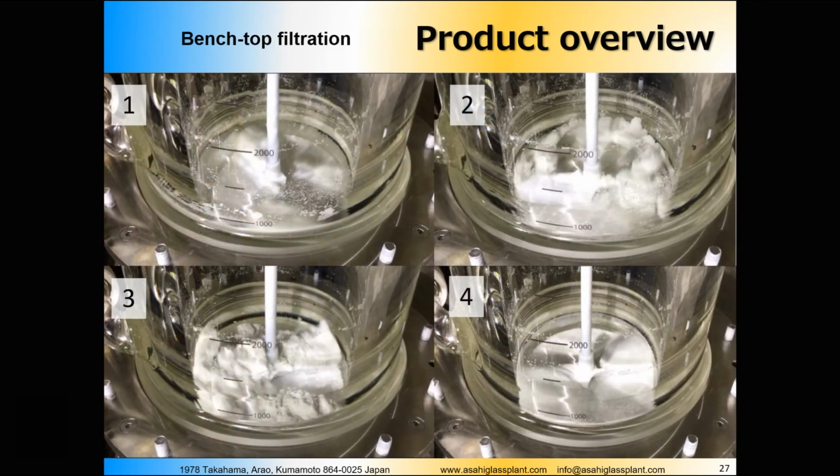So here on the slide you can see how it works. In the beginning we have a very wet sediment, and then we dry for a certain period of time, and then we get the completely dried substance in here.